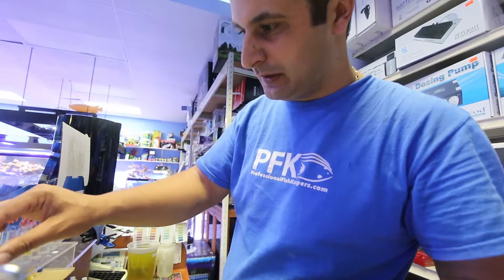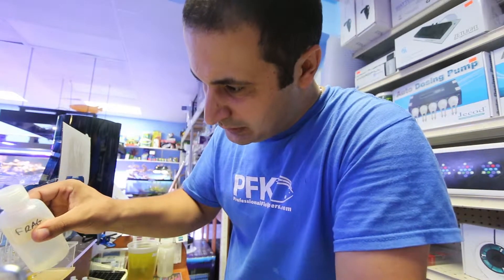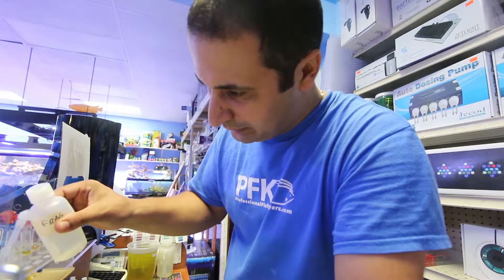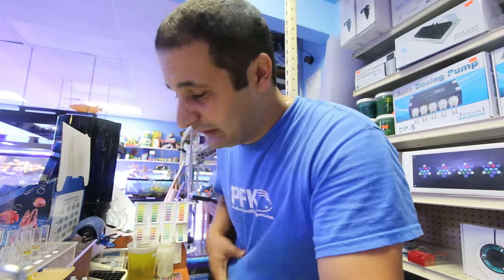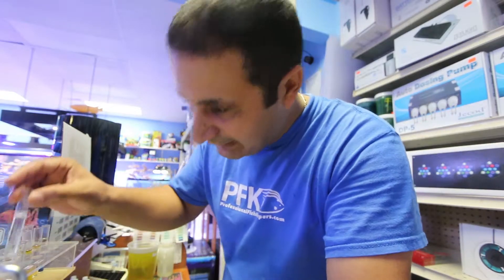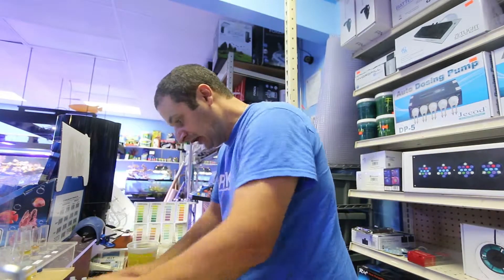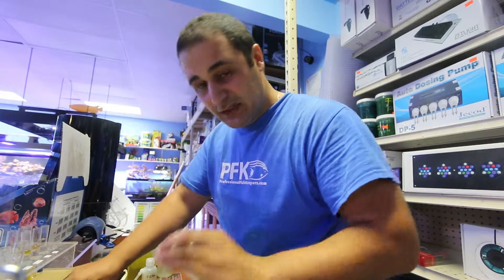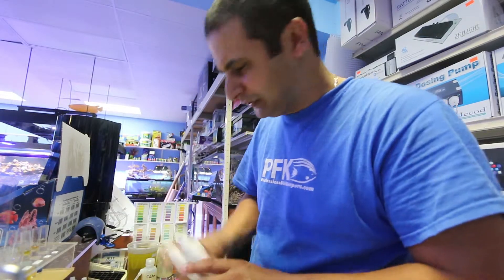This is a saltwater tank — actually one of my own tanks. We're testing pH, ammonia, nitrite, and nitrate. Each test uses about five milliliters, so you fill the tube up to the line. One very important thing with API test kits: you have to shake the bottles really well.